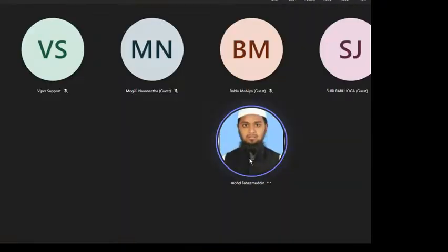Okay. So why am I keep putting off this one? This contains a lamp that will last 4,000 to 5,000 hours. If you want to replace that, we need to spend again 3 to 4 lakhs.